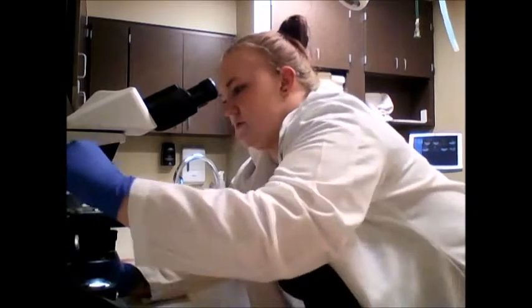There are a lot of parabasal cells. So my guess is that we're in diestrus right now, but let's go ahead and take a closer look.